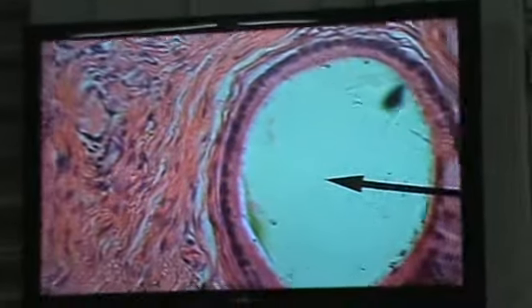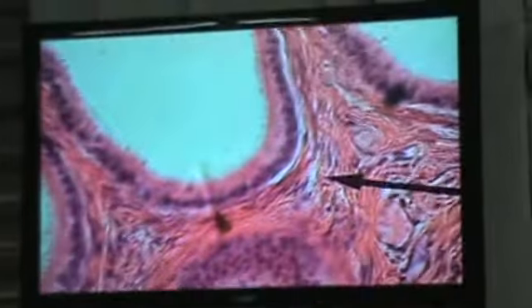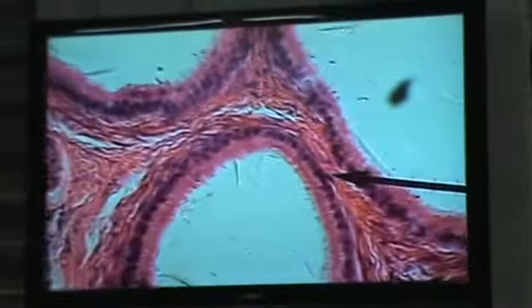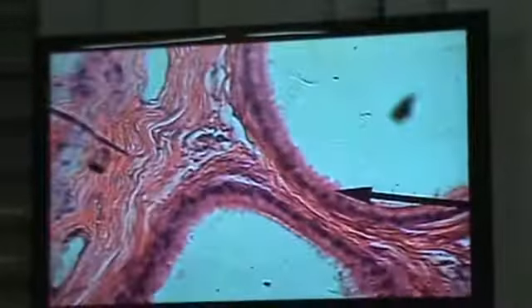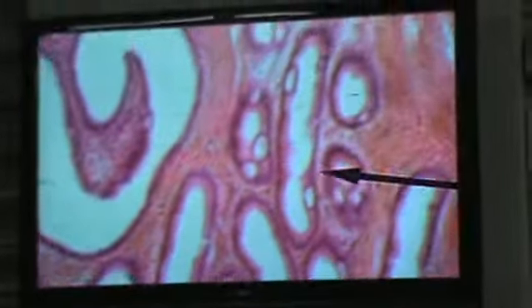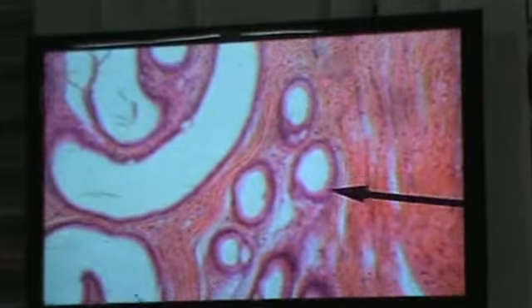We usually find spermatozoa in them, but not always. Not always, okay? But these here have smooth muscle surrounding their walls and pseudostratified columnar epithelium with stereocilia. So these are the large stereocilia. Okay, so what we want is to find one of the smaller ducts. Let me come down here. That's leading into them. Small little guys leading into them. Right? These are the ductuli efferentes.